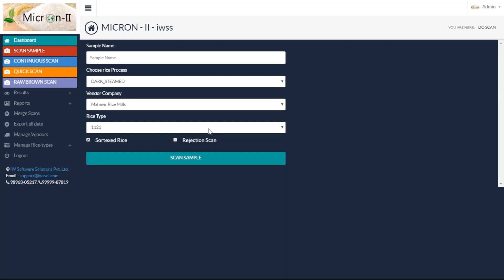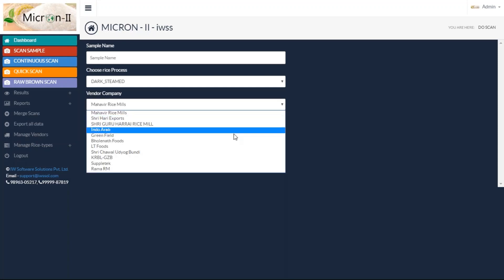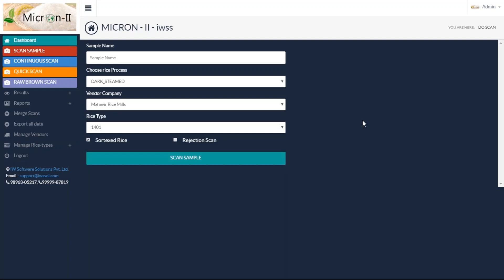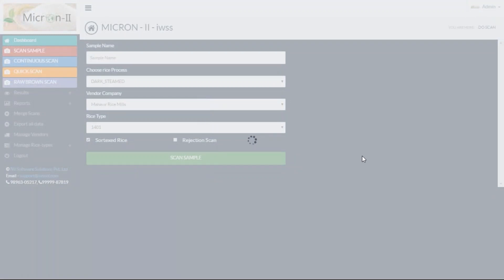This is dark steam, the one I'm checking. Then, what rice variety — I set this as 1401. You also need to choose your vendor. In case you're an exporter procuring rice from multiple sources, or you're a trader, you select which particular vendor provided this rice sample. When I click scan sample, it takes around 20 to 25 seconds. The grains you put in the scanner will be scanned and analyzed, then the report appears on your screen in maximum 25 seconds.